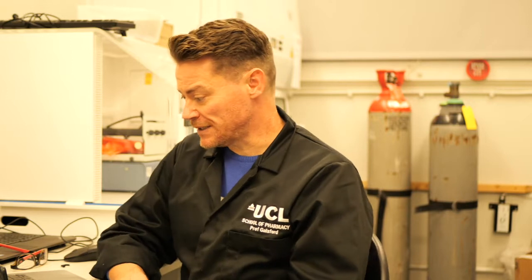The word microscopy itself derives from Greek, as a lot of these words do, and the basic word is micros, which means small, and scopio, to look at. So it means looking at small things, which is very appropriate.